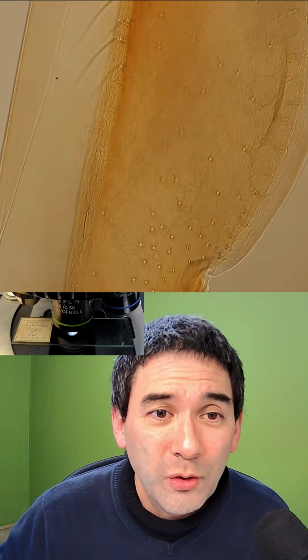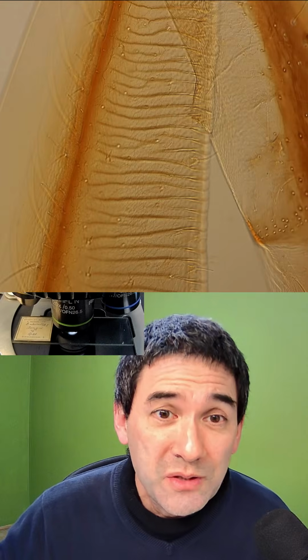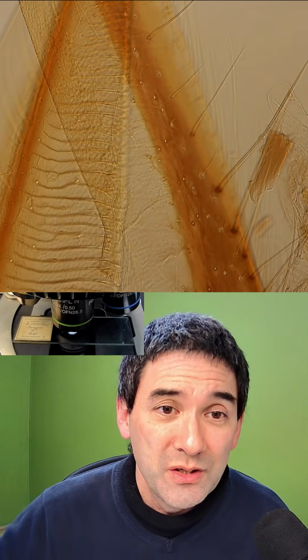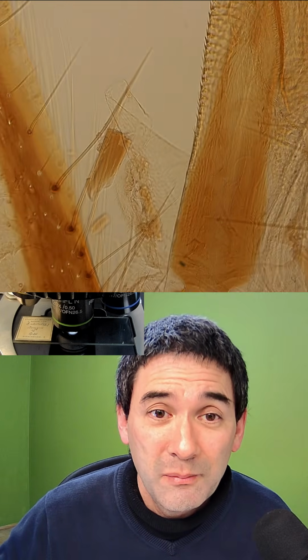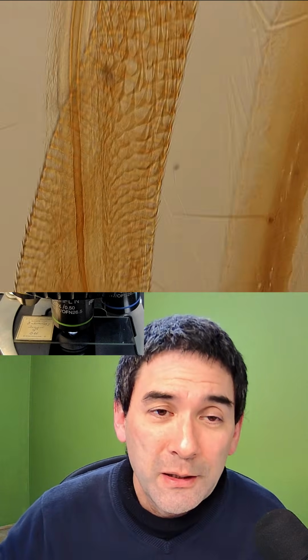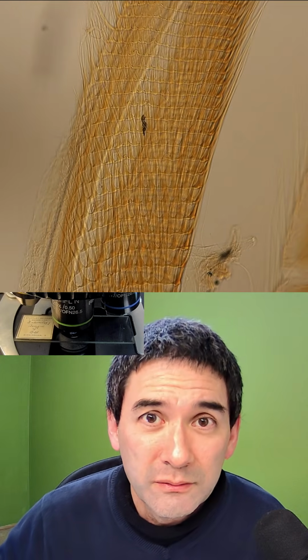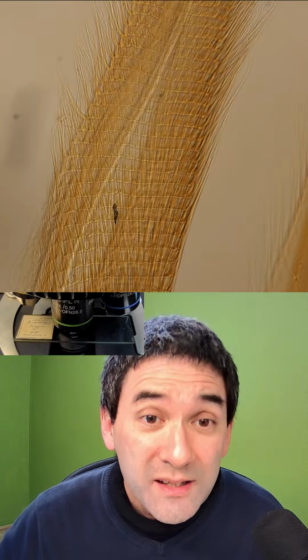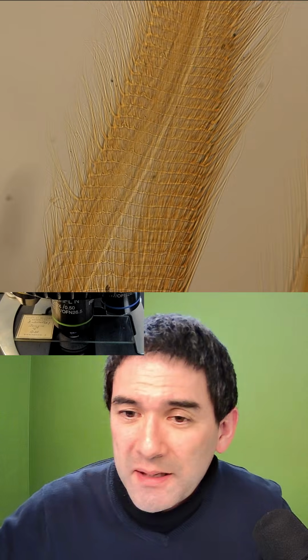Over time, sometimes the techniques and methods that were used in the past are simply not allowed anymore. It's simply not good to use them anymore because of safety issues. At that time, many people simply didn't know certain things, especially concerning radiation. Not so much of an issue in microscopy, but back in the day, especially with radioactivity and so on, they were very often, according to nowadays standards, quite careless. But people simply didn't know. So that's basically a B.